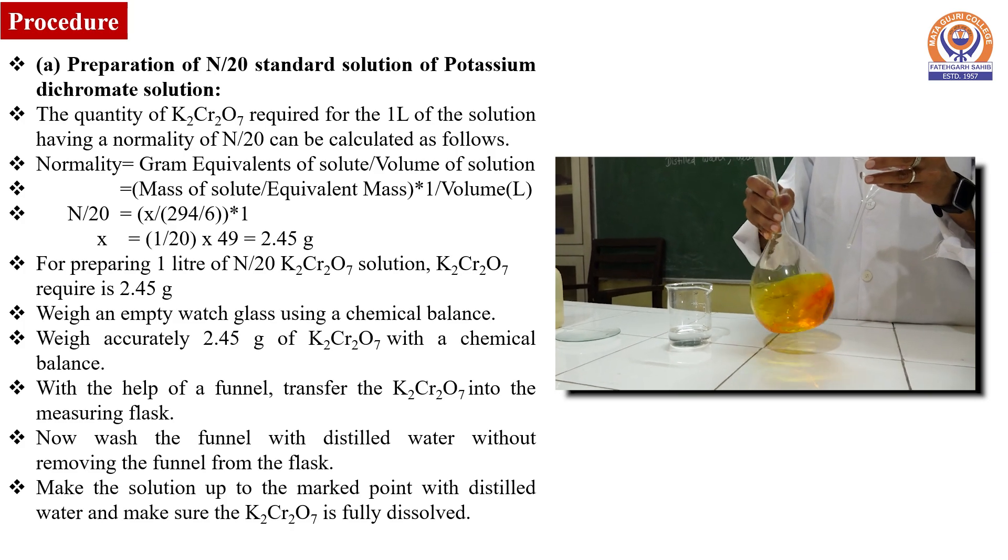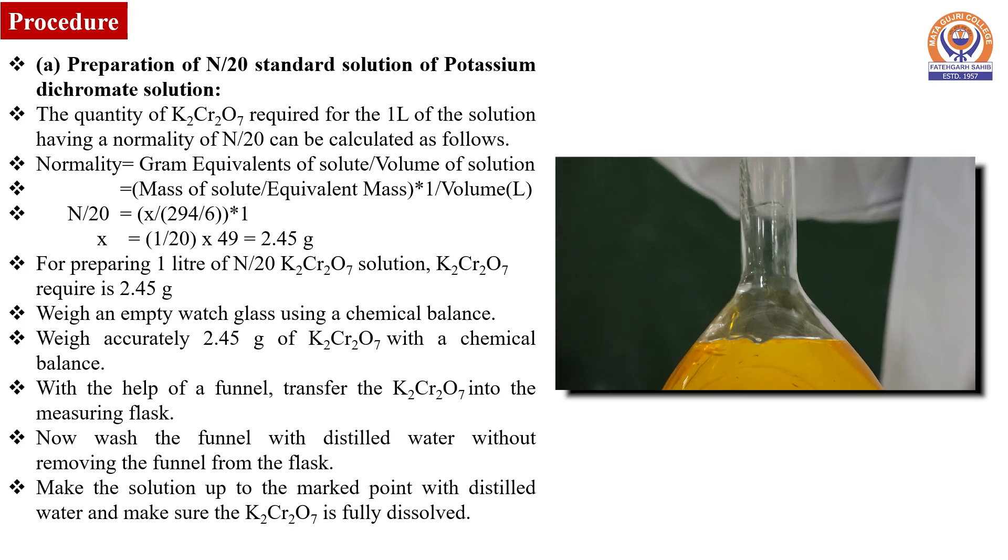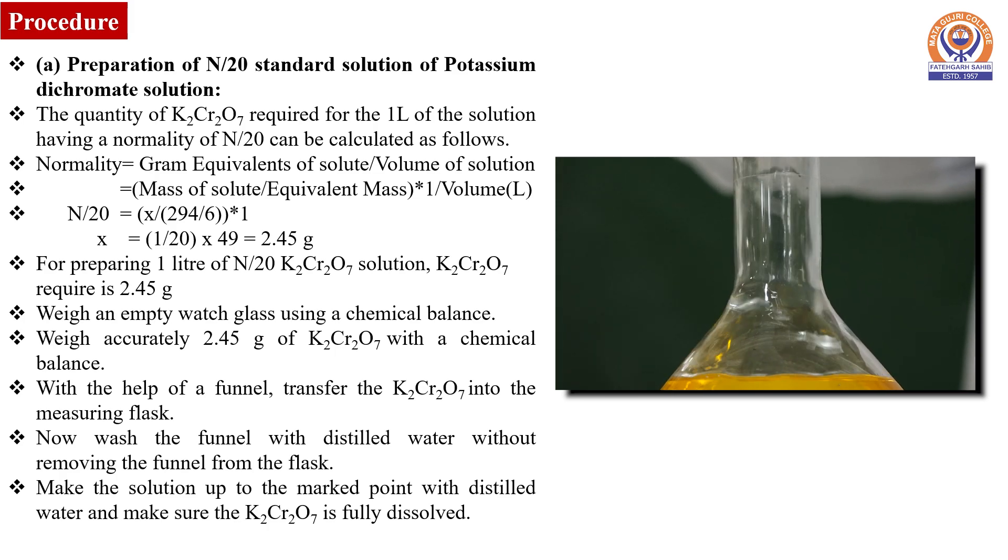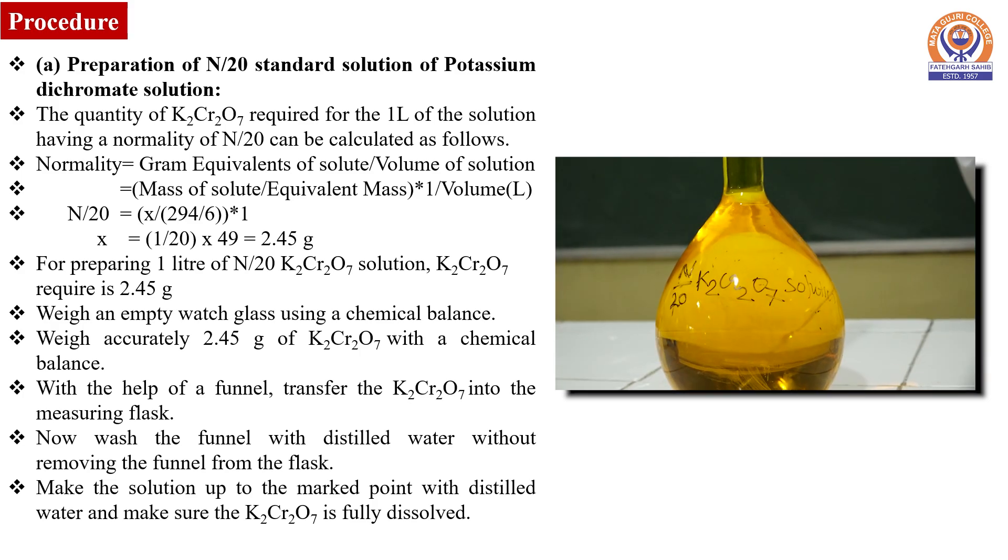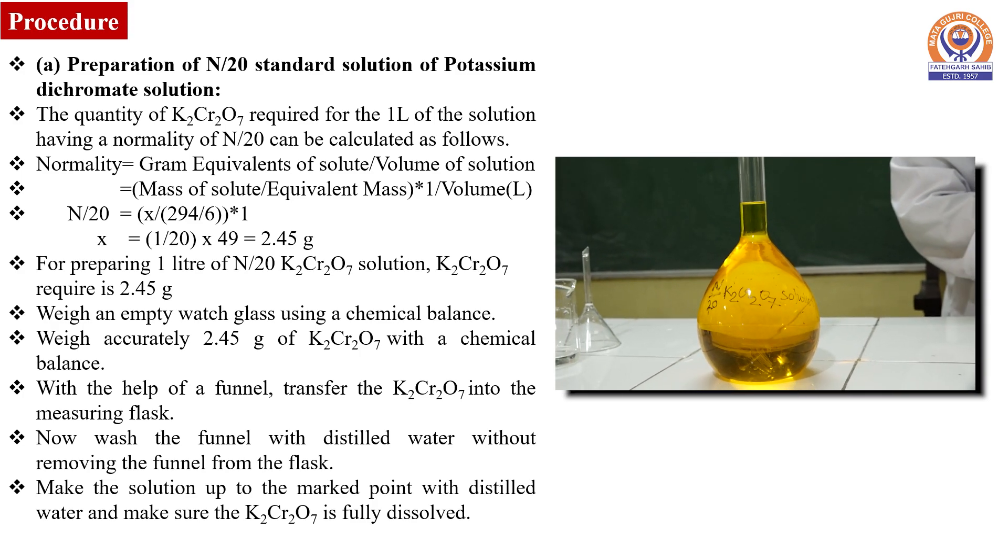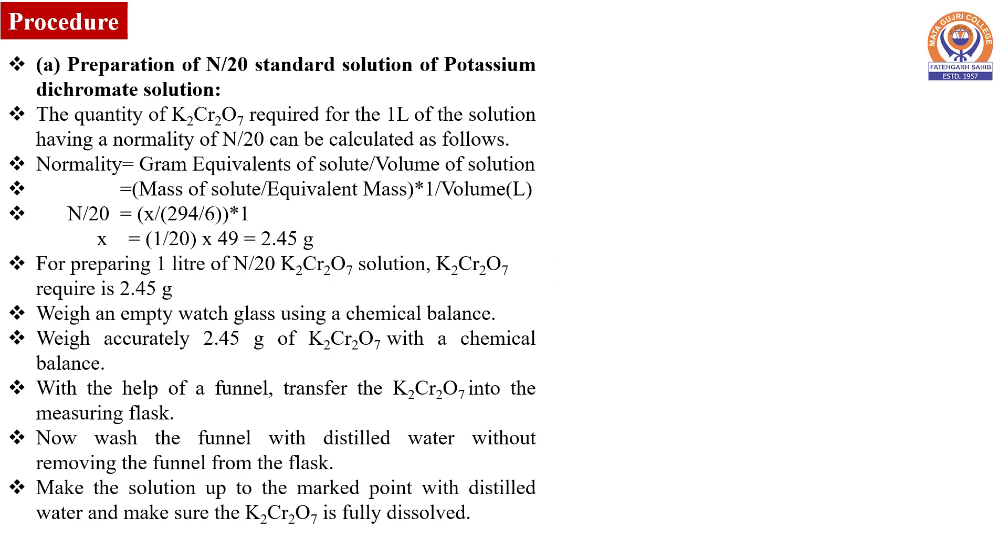Make the solution up to the marked point with distilled water. Shake the solution to make sure that potassium dichromate is fully dissolved. The solution is labeled as N/20 standard solution of potassium dichromate.